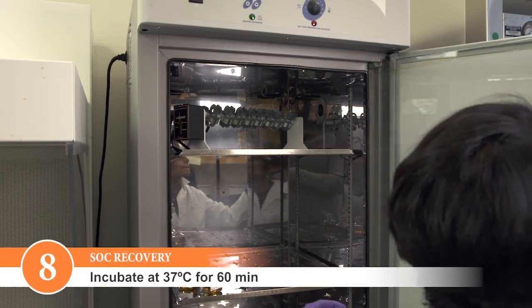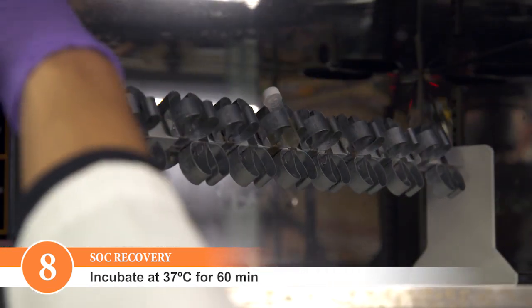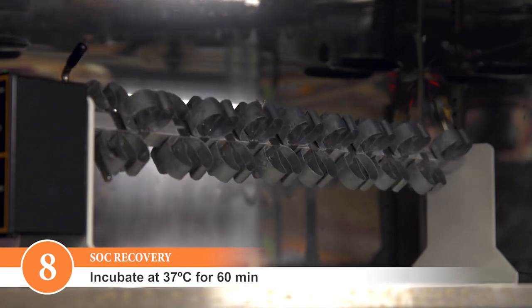Incubate the transformation mixture at 37 degrees Celsius for 60 minutes. Shake vigorously at 250 RPM or rotate.